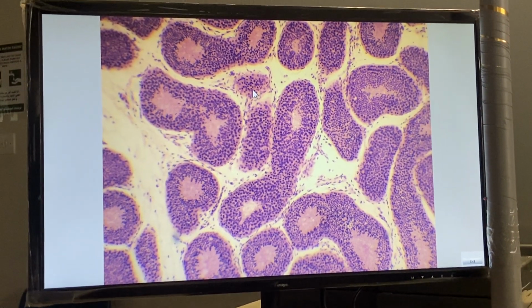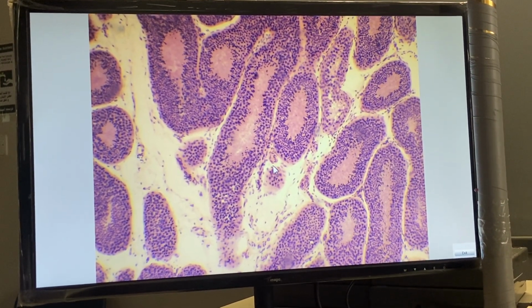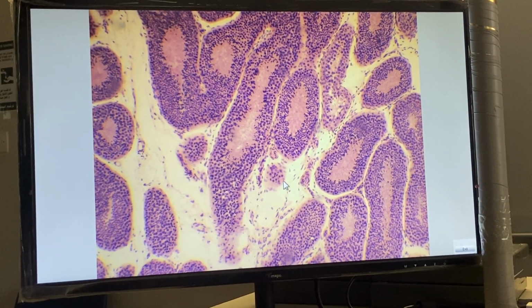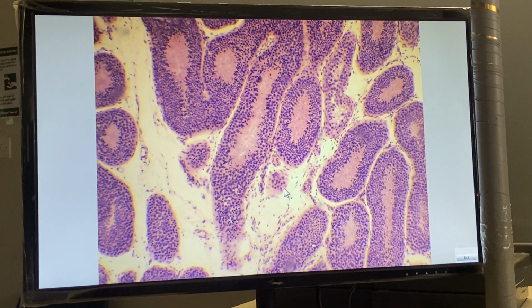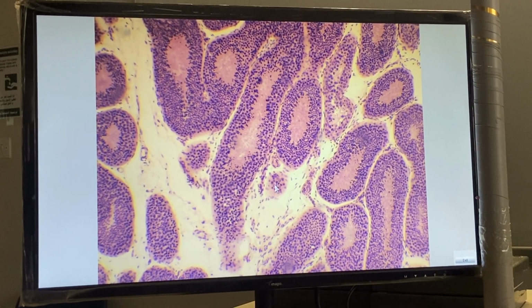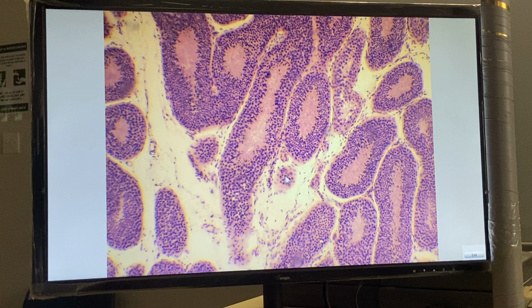consists of connective tissue with fibroblasts, blood vessels, and interstitial cells or Leydig cells. These cells are small, rounded, with spherical nuclei. These cells secrete testosterone. Leydig or interstitial cells found within interstitial tissue between the seminiferous tubules.